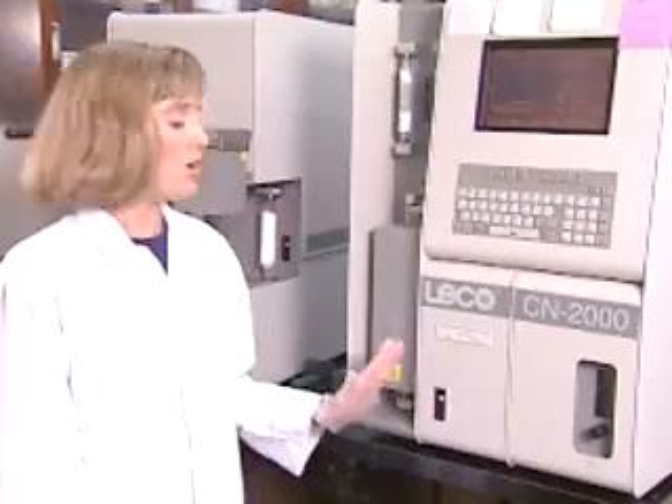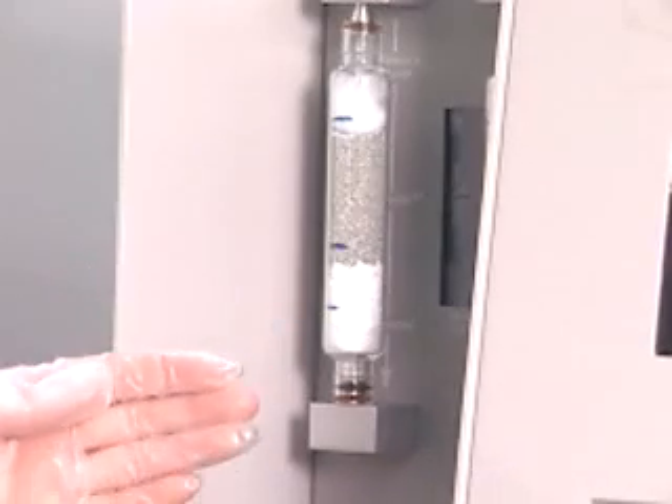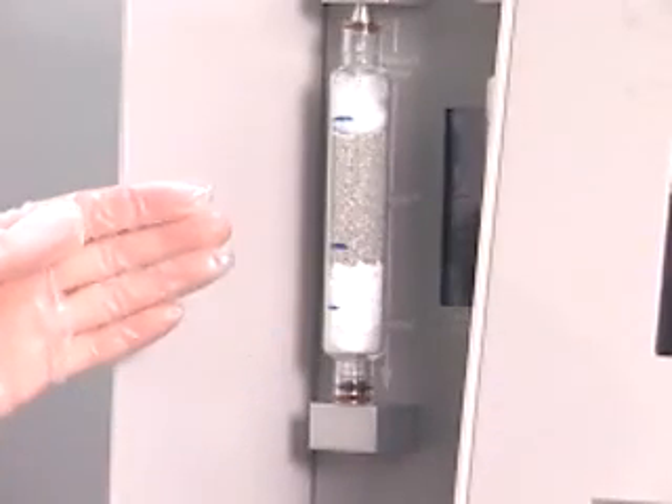Another portion of the gas is analyzed for nitrogen. It is carried with ultra-high purity helium through this column, where all the nitrogen gases, including the NOx gases, are converted to nitrogen gas and all the oxygen is removed. It then passes through an anhydrone and lecosorb column where water and carbon dioxide are removed. The sample gas is then analyzed for thermal conductivity by comparing it to a stream of ultra-high purity helium gas.